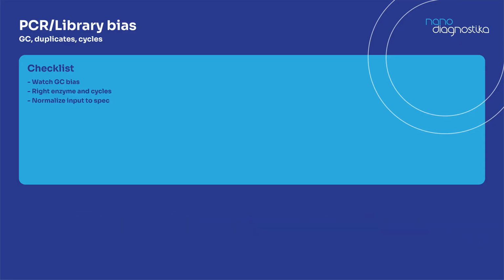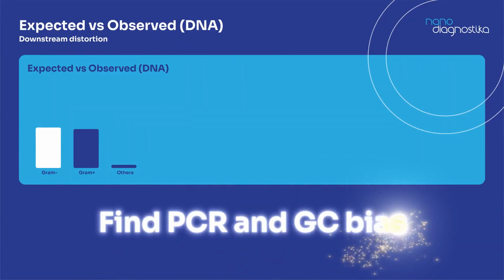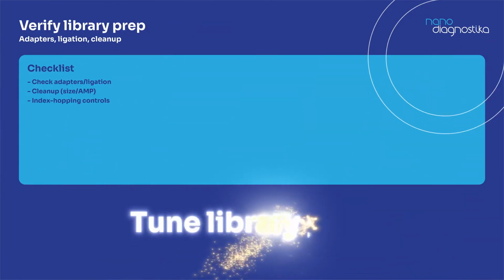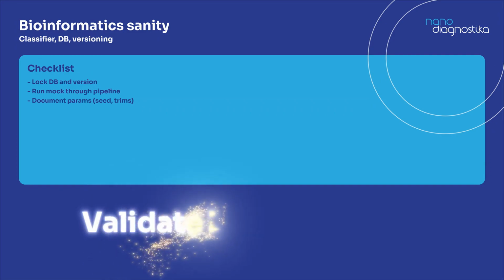By removing the cell breaking step, a DNA standard eliminates any extraction variables. This makes it ideal for pinpointing biases such as PCR amplification bias, for example GC content bias, or sequencing preparation errors. Researchers use DNA standards to optimize library prep conditions and validate their bioinformatic pipelines.